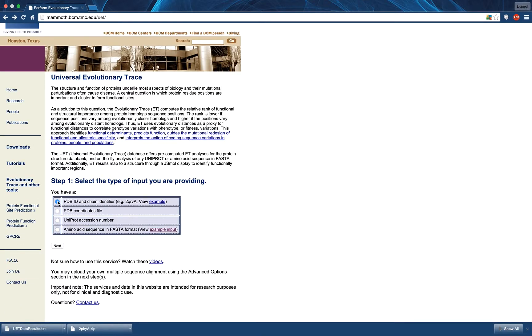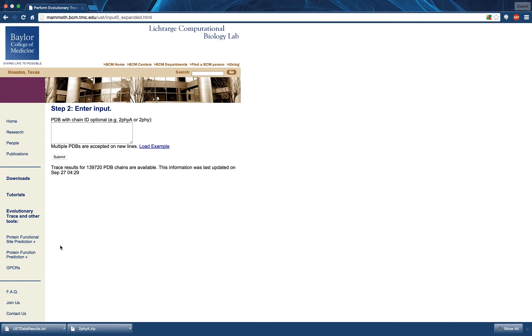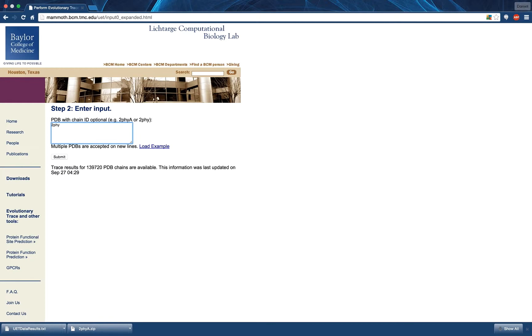Finally, we look at the PDB ID and chain identifier input. This interface has changed significantly since the original release of this web service. It is now possible not only to upload a PDB ID and chain identifier, but also the PDB ID without the chain identifier, or a list of such inputs on separate lines.